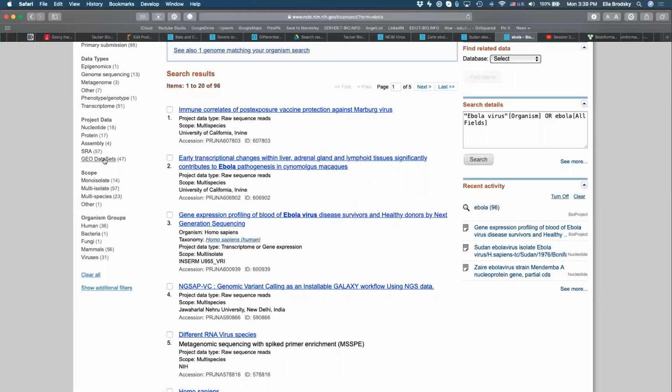Okay. So yes, you can probably go through here as well, but then going into this specific project, sometimes you might not be able to find the source data. So whenever we get to a point when you're able to think of your own project, depending on the question that you're trying to address, you want to find the appropriate type of data that you would like to use to answer that question. Okay, thank you. All right, great.